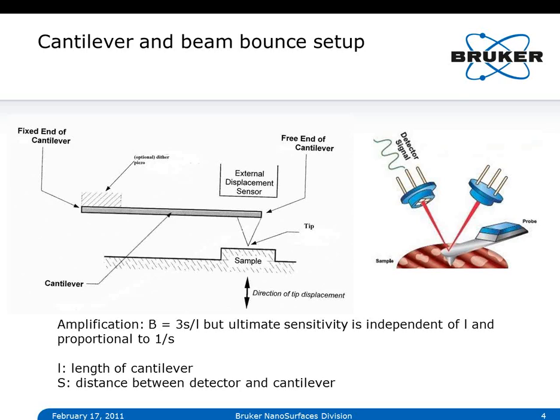So every time when I say tip, I basically mean the tip cantilever assembly, and that is very common when you go through the literature here.